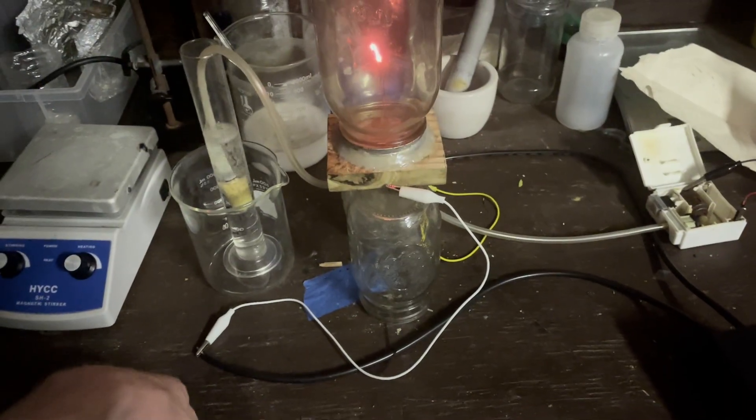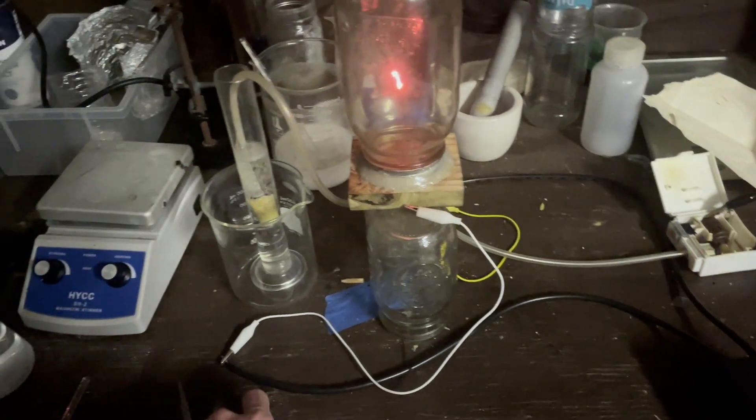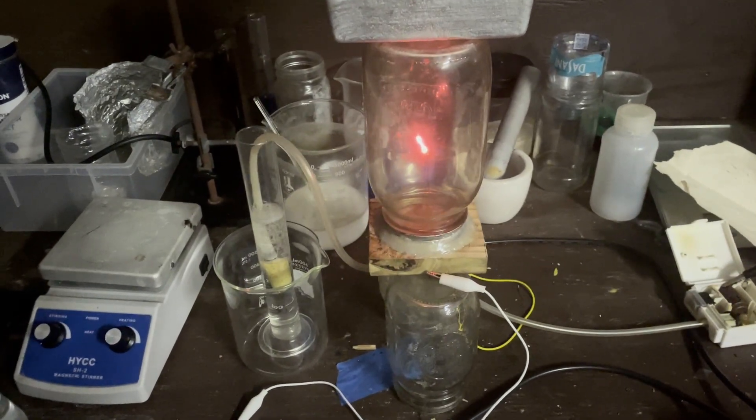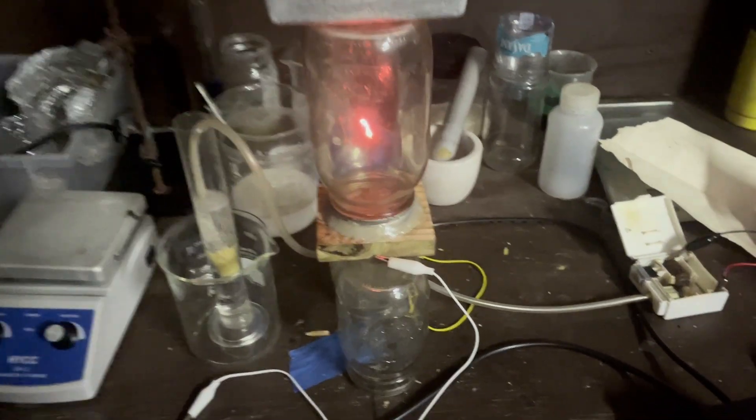That's going to be azeotropic nitric acid, so it's not completely pure. We're going to do some math with that, and then we're going to figure out how much nitric acid per hour this produces. And with that, let us end our run.